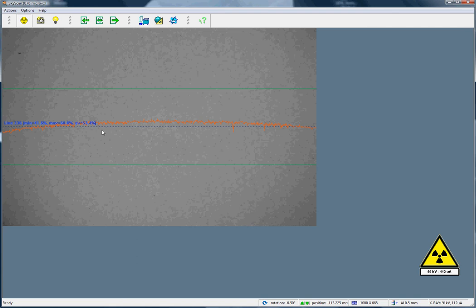If this value is too high, then the camera enters a non-linear regime and approaches saturation. For both of these reasons, we aim for an intensity in the uncorrected image of 50%.